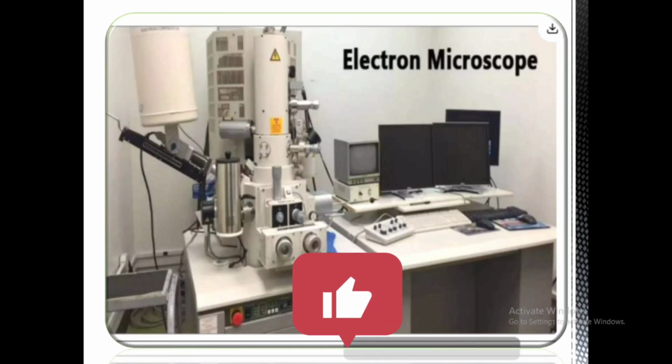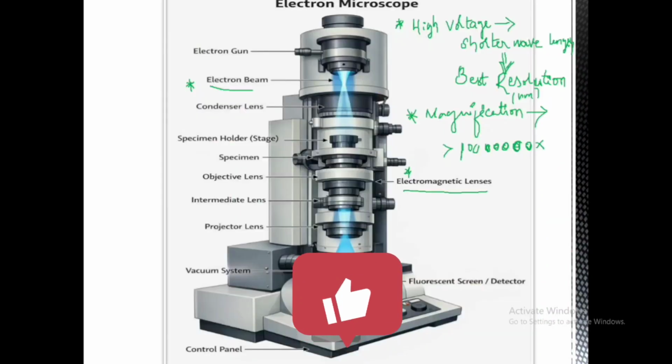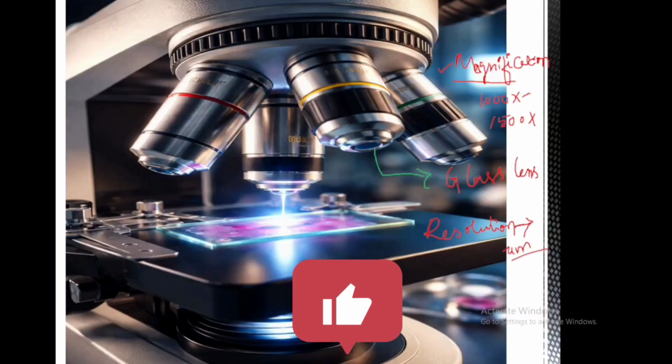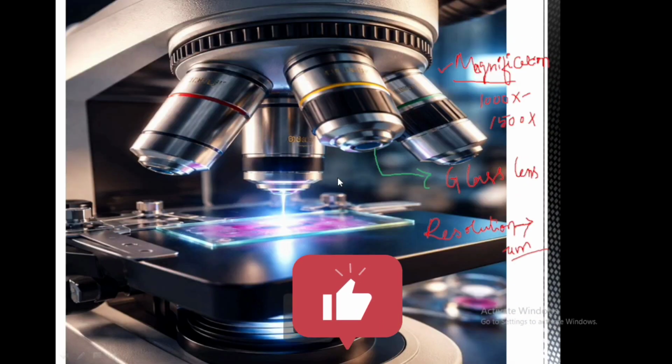Before going to the parts of the electron microscope, first we can see the differences between the light microscope and the electron microscope. This image is a light microscope and this image is an electron microscope. The first difference is the radiation source. In a light microscope, the radiation source is visible light, present over the base, acting as the radiation source or illuminator.